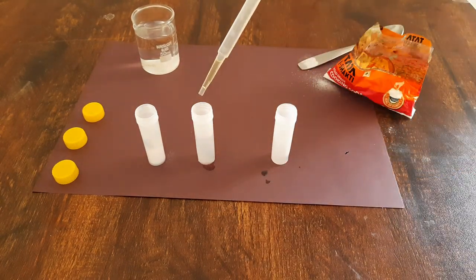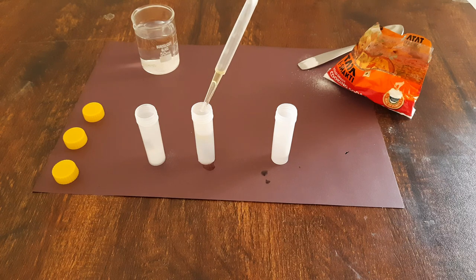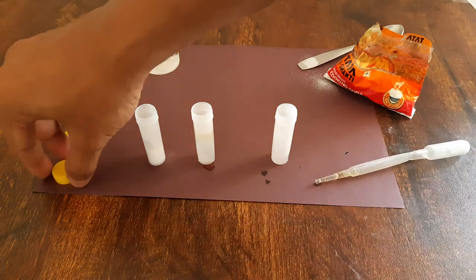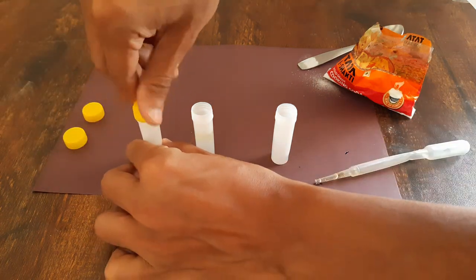And in the second tube where I added some boiled water, I will add a layer of oil on top of it. Now I will close all of these tubes.